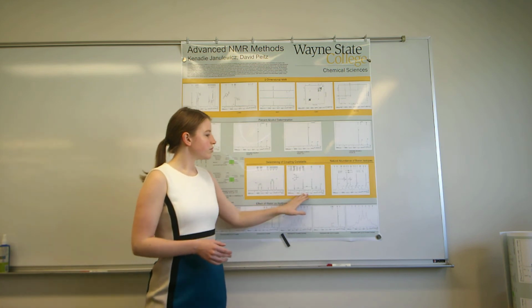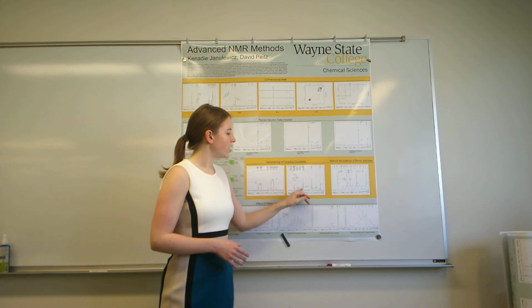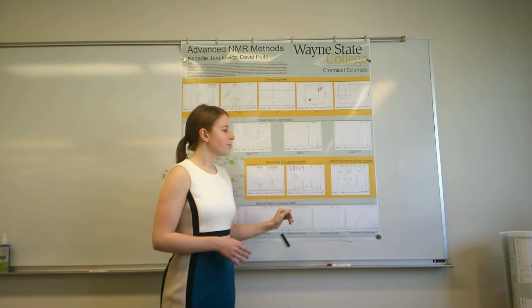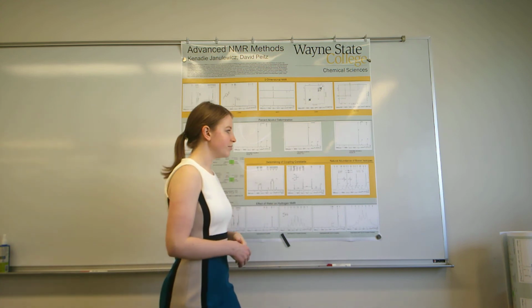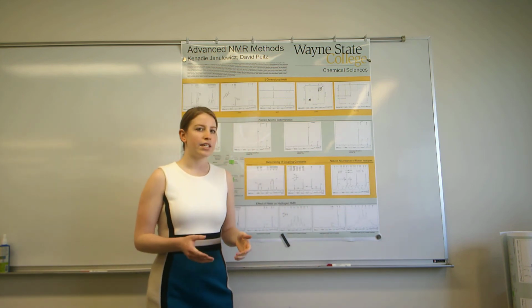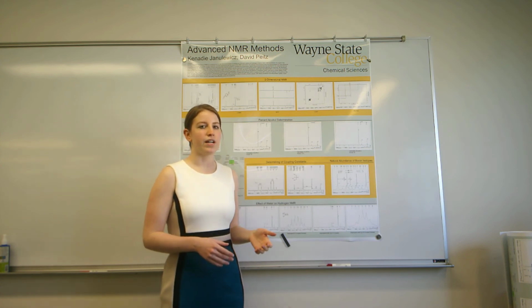We also did this with trimethyl phosphate. Our carbon to hydrogen coupling is large at 148, and our carbon to phosphorus long-range coupling is only 6. This produces a quartet of doublets, but it's really interesting to see carbon coupled to something other than hydrogen. We also calculated the natural abundance of boron isotopes, and this is unique as boron does not have a nuclear spin of 1/2 like carbon, hydrogen, or phosphorus.